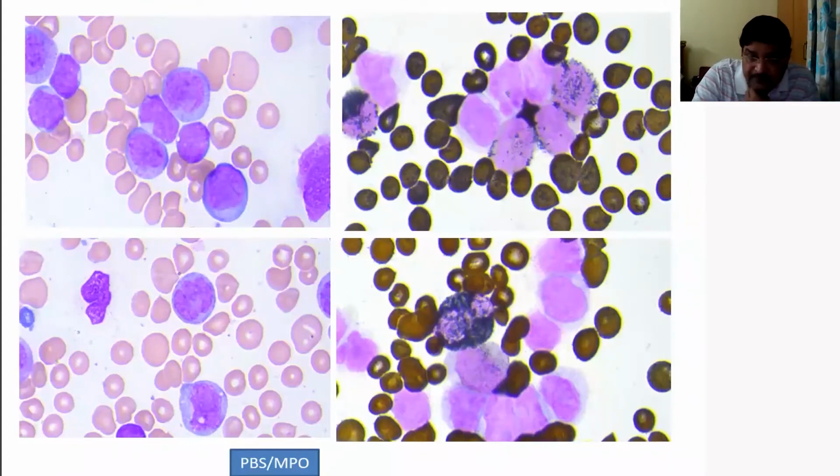Whereas many times what happens is cytochemical MPO is plus minus, as it is in the lower outer quadrant. So flow cytometry is important. The morphology of these cells are classical blasts, but some blasts are a little variant in morphology. Some are with a lot of folds, some are monocytoid, some could be promyelocyte looking. So it is important that you look for the features on flow cytometry.